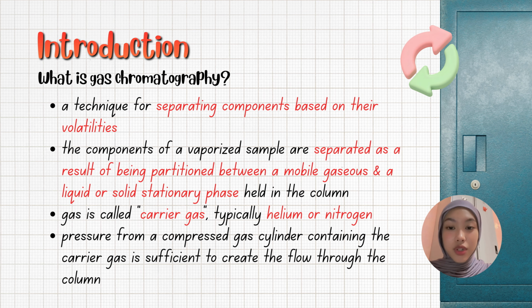Gas chromatography or GC is an analytical technique used to separate the components of a mixture based on their volatilities. It is especially suitable for compounds that can be vaporized without decomposing. In gas chromatography, the sample is first injected into the instrument and vaporized.